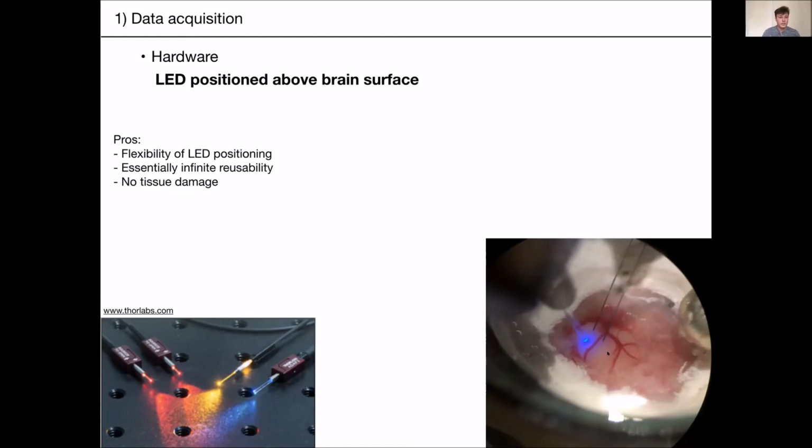You can use dental cement or epoxy, and you can literally stick 2 probes together by eye, trying to be careful to have them very parallel to each other, and you can then attach them with 2 headstages to a single rod attached to 1 manipulator, which allows you to more easily insert your probes, because it gets very crowded very quickly.